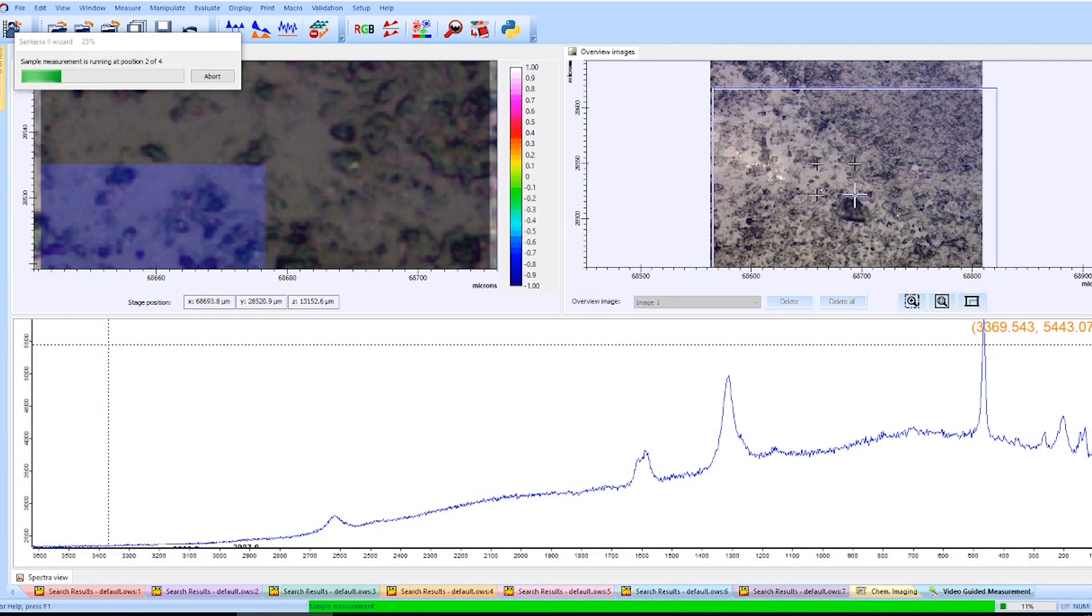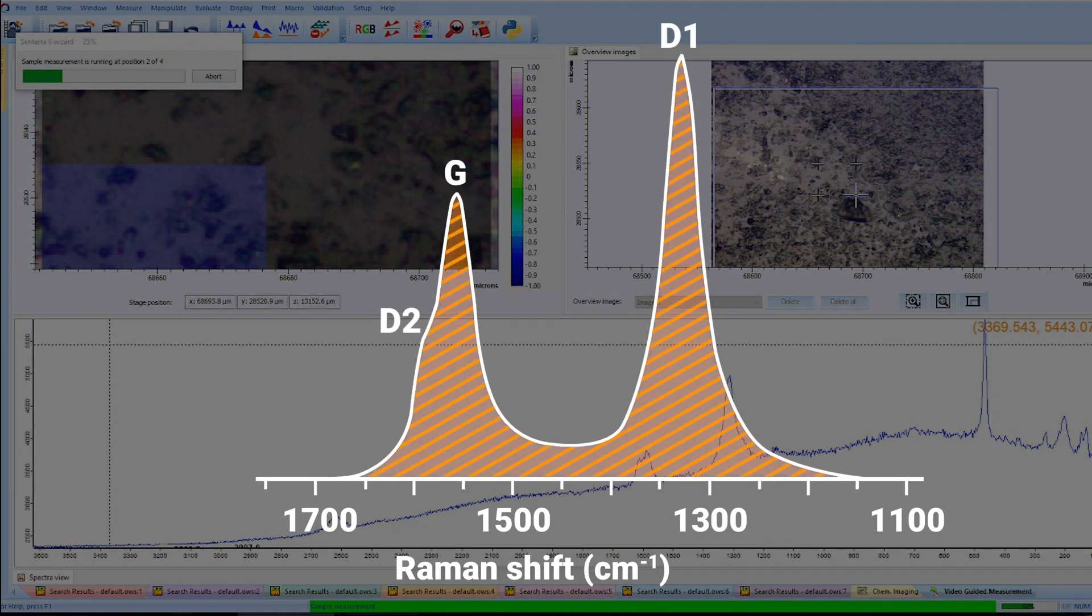Following this, we carry out a measurement after which the OPUS software determines the area ratio of the D and G bands of the carbon, which is temperature sensitive.